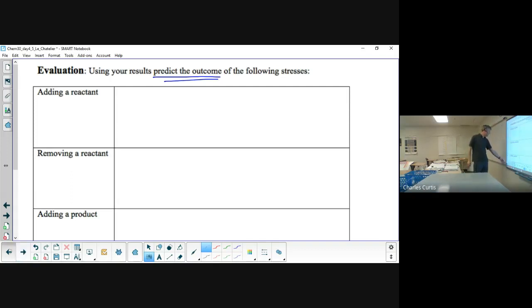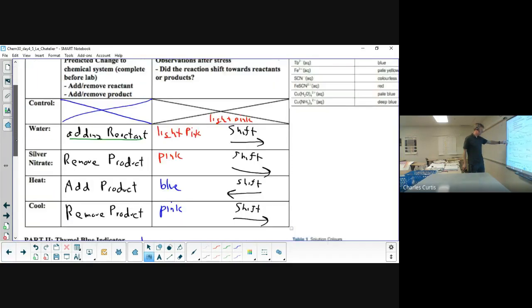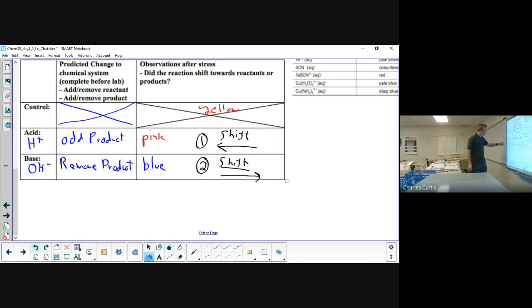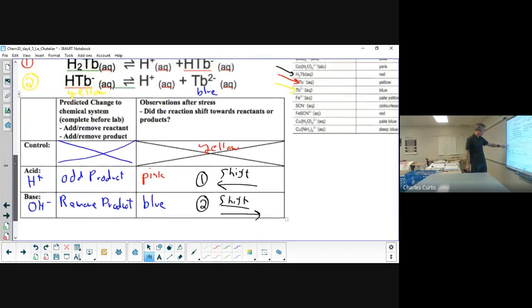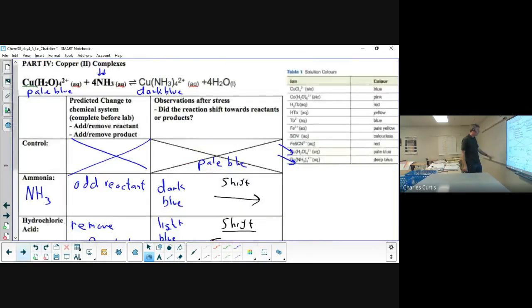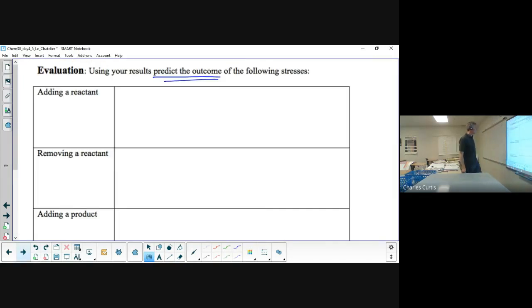So I'm going to flip back through our data. Do we add a reactant? We did. Here we added a reactant and it shifted forward. Going down into our second experiment, we didn't add any reactants. So from our first two, we just have one shift forward. From our last experiment, we have another add reactant and it did the same thing, shift forward. So it looks like when you add a reactant, you get a forward shift. I'm not going to use words, I'm just going to use the arrow to show my shift.